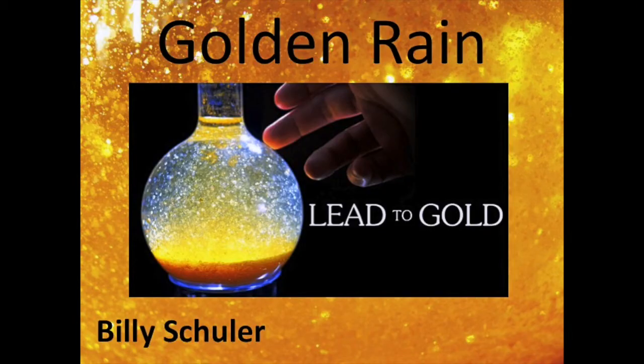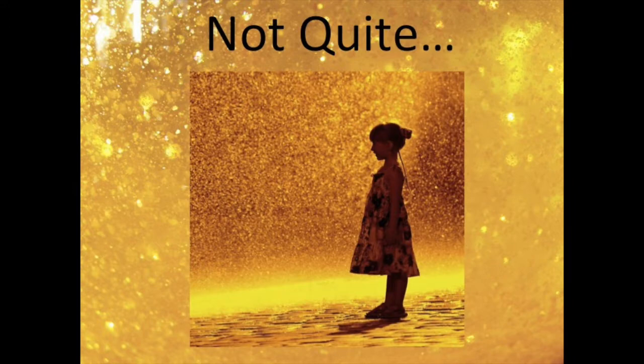My name is Billy Schuler, and today I will be taking you through the experiment known as Golden Rain. Before we start, let's talk about a few topics that are important to know if we are to fully understand what is happening in this experiment.